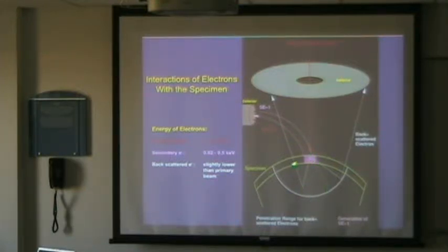There may, however, be secondary electrons also generated in this kind of volume here or here, but they're typically much less. So for an image, like I showed you before, what you collect is the electrons from that volume. And because they have a pretty low energy, you can suck them off. You put a positively charged detector in there with a certain power, and the electrons fly towards it. So you can collect them picture point by picture point.